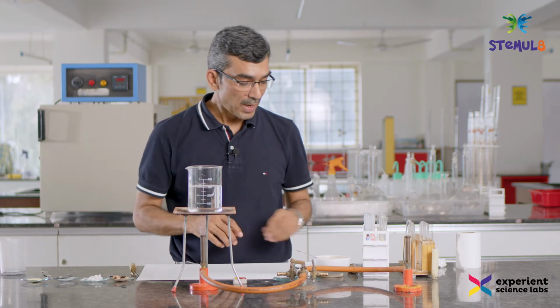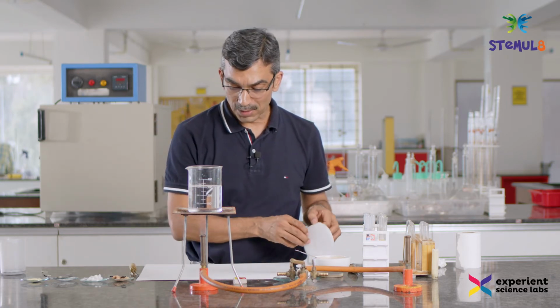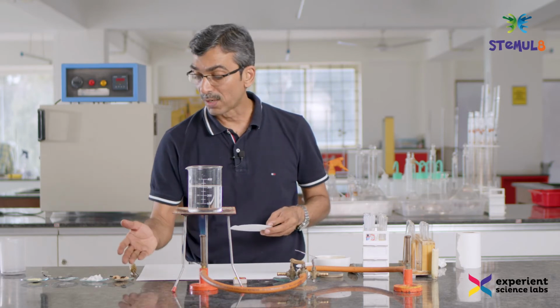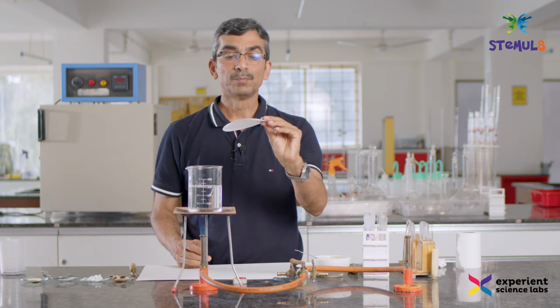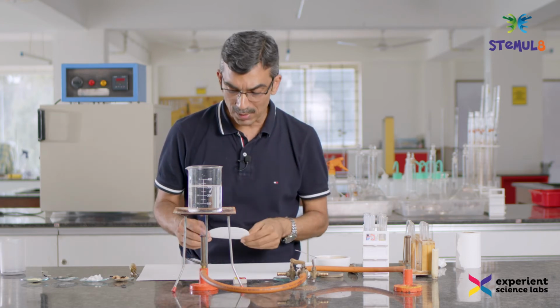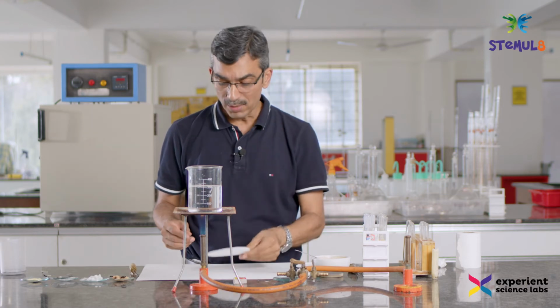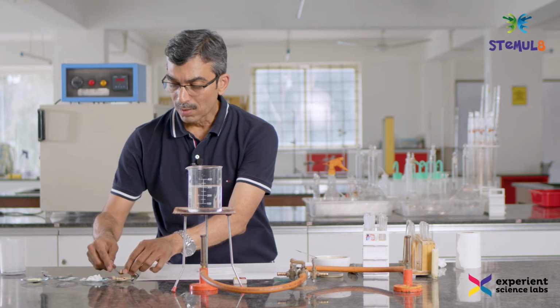While the water gets heated up, I will look at how we can test for the presence of fat. If you can see this filter paper, right now it doesn't have any patches or transparent sections on it. I will add groundnut to it.